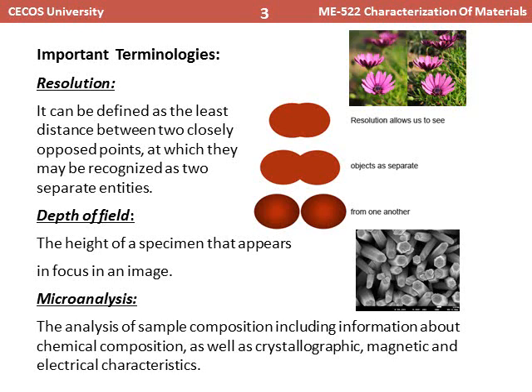To some point we can feel the height, but you can just feel the height. The image taken by SEM will not give you 100% how much the height of the object is.